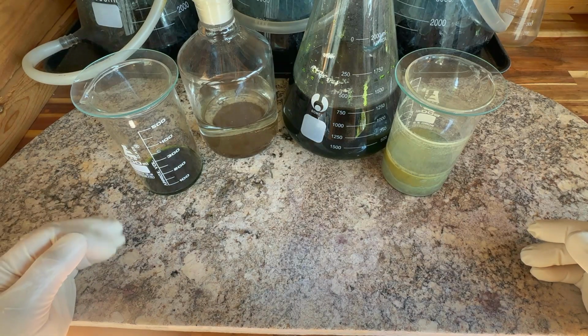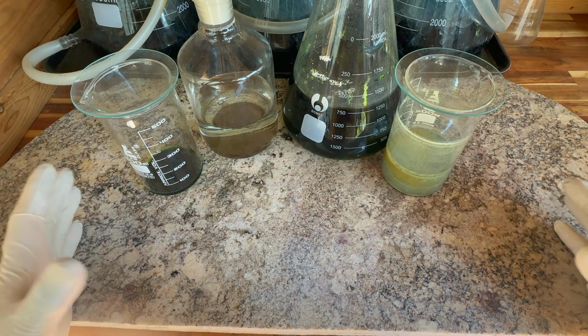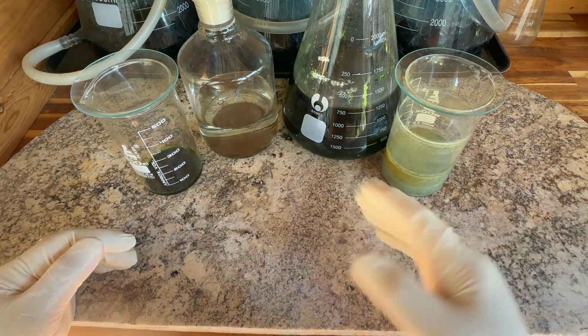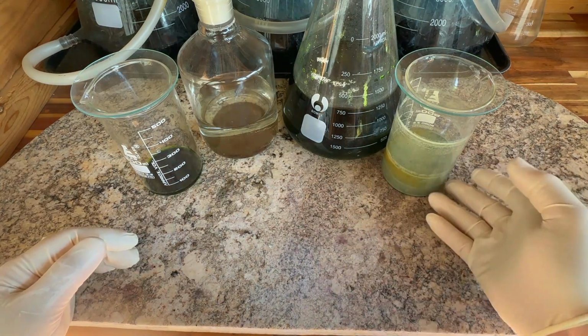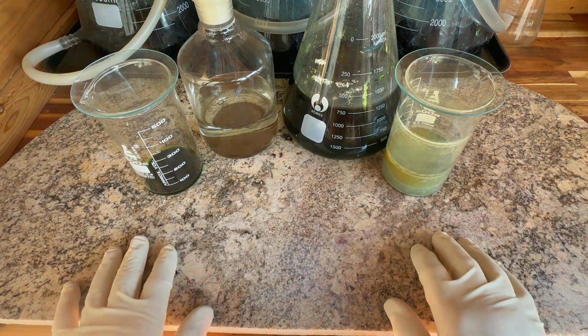So you can see in front of me here, I have a number of leftovers from various refinings. Over the next few videos, I'm going to process these and turn them from these ugly solutions and beakers into beautiful metals.